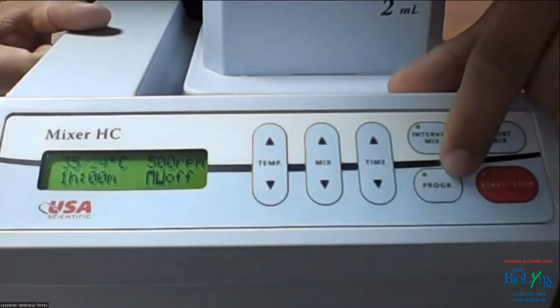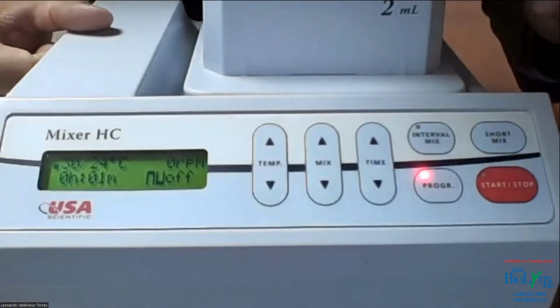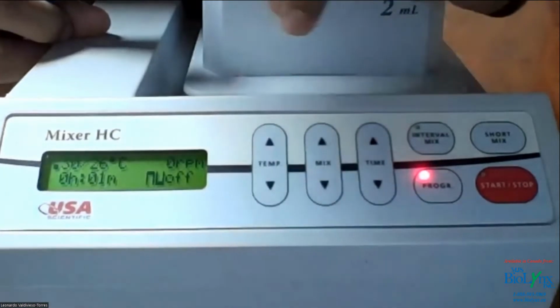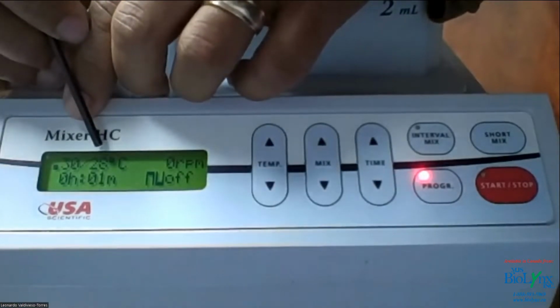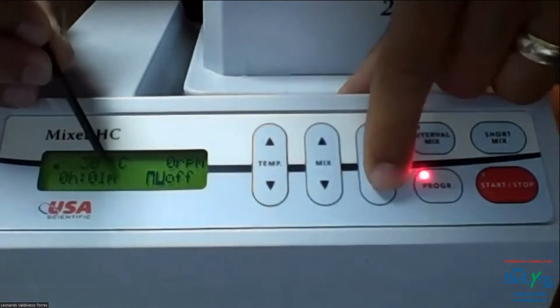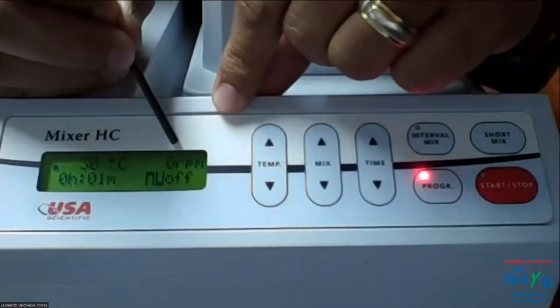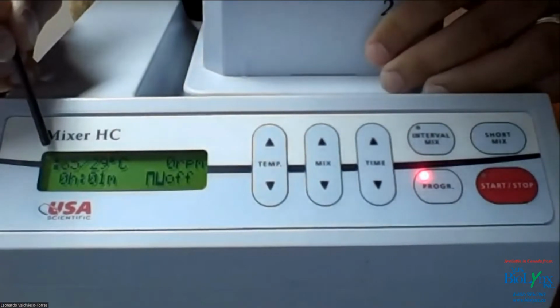So we're gonna click here where it says program. Can you see program? Yes. Okay. So I'm gonna click on it. The light turns red. You see that little dot right there? That means step number 1. So we're gonna adjust the temperature to 30 degrees Celsius. This is the temperature that you are actually adjusting the machine to go to. And this is the actual temperature right here. This is where you adjust the time. So you can see that it's set up at 1 minute already, but you can go up to an hour. You can go even past an hour. We're not gonna do anything for the RPMs. The RPMs are right here, but we don't need to mix anything. And this is the interval function, so we're gonna just leave it off. We're gonna click again on program. Can you see there are 2 dots now?